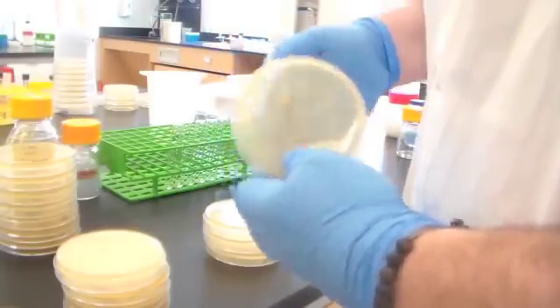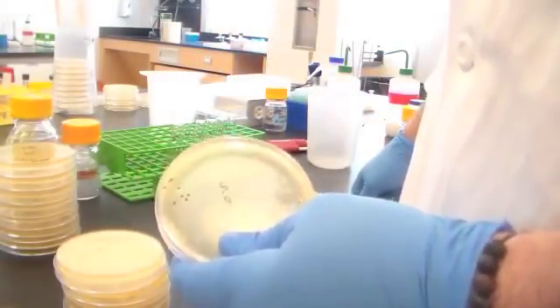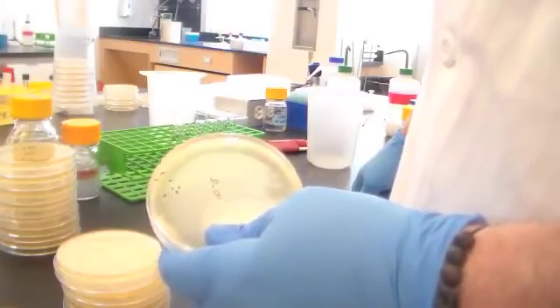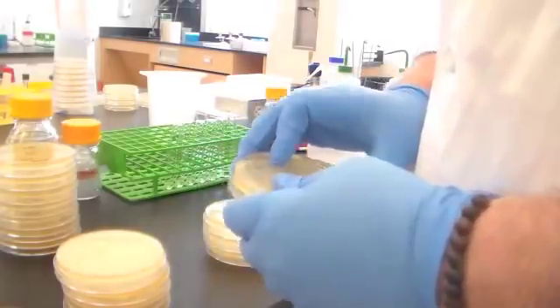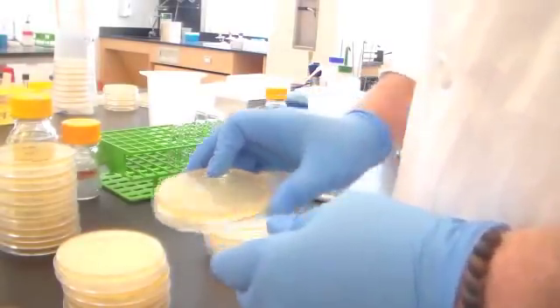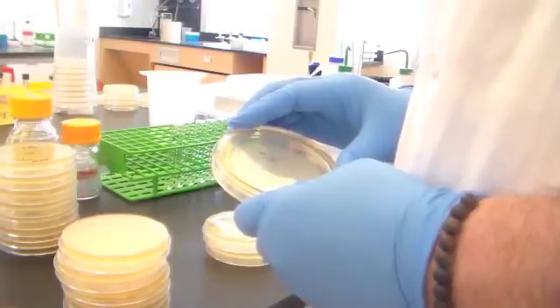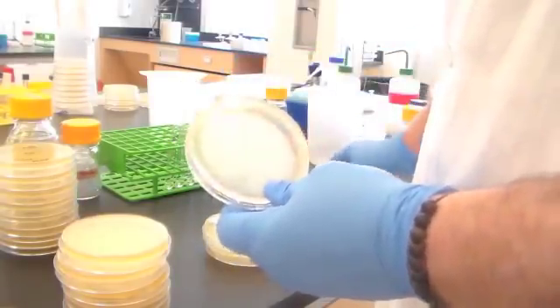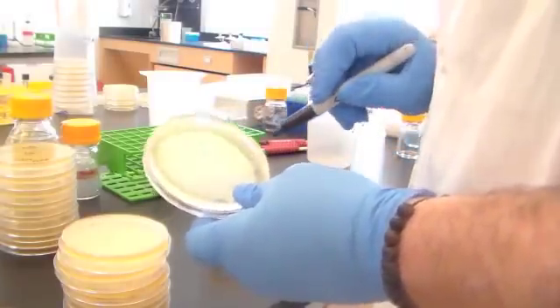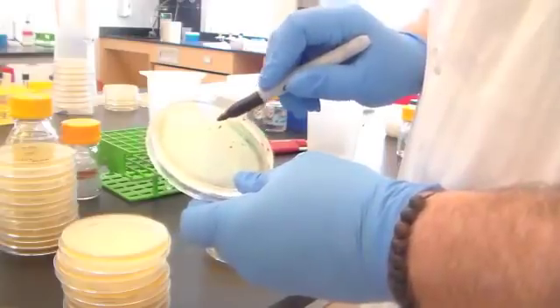Now, you want to look for a plate that has probably no more than 250 colonies, because if there's more than 250, there's a chance that you'll miscount. And you want to have a plate that has no less than 25, because pipetting error could really skew your results. Here's the 1 to 1 million dilution. So this would definitely be much more countable. So this would be 1, 2, 3, 4, 5, 6, 7, 8, 9, 10, 11.